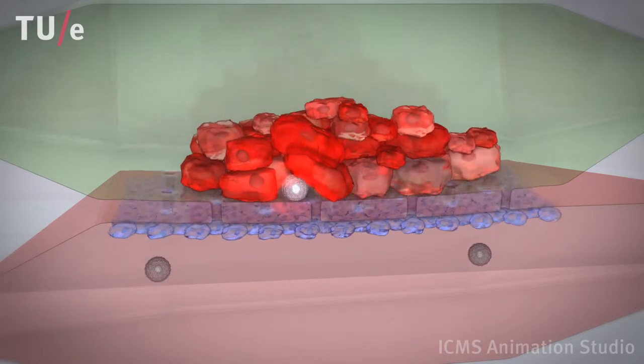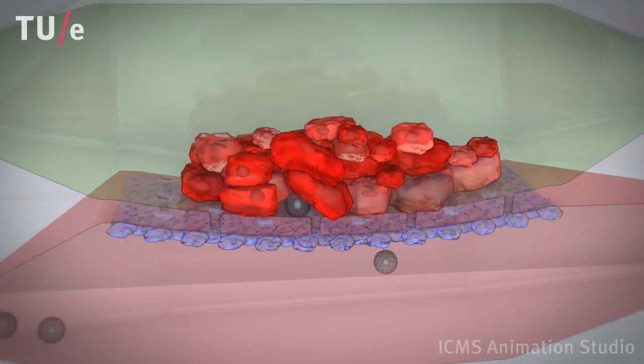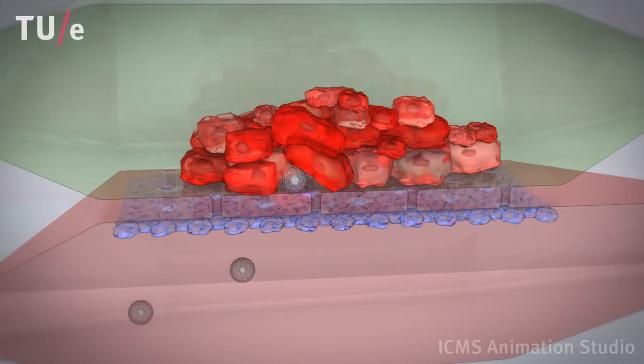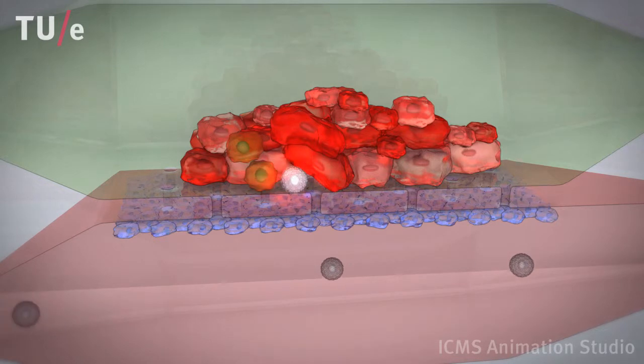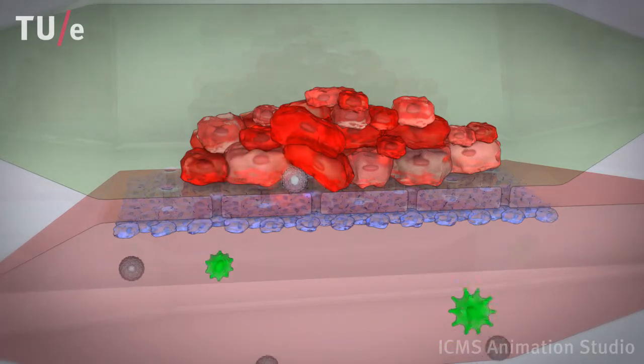Under the influence of immune cell signals and mechanical stresses, some cancer cells may change properties, become invasive, enter into the bloodstream and become circulating tumor cells.